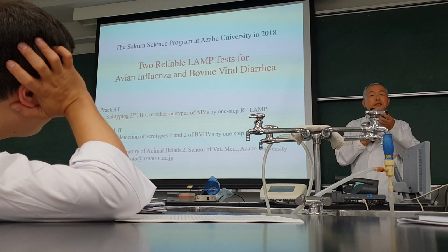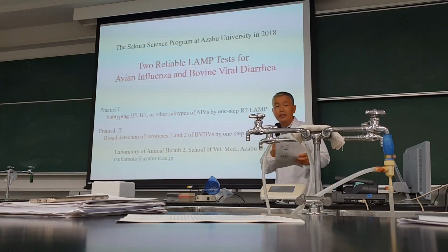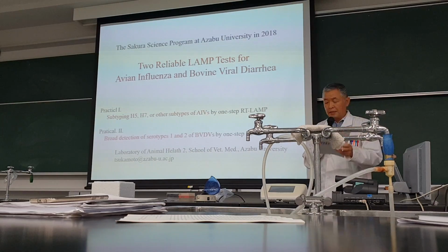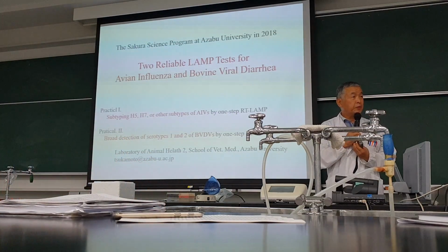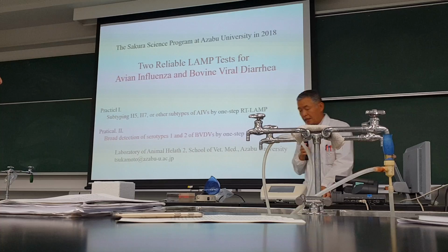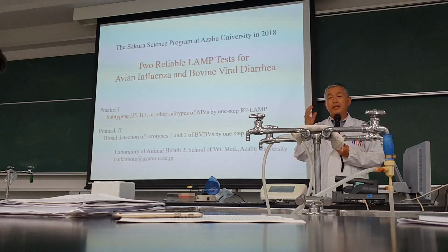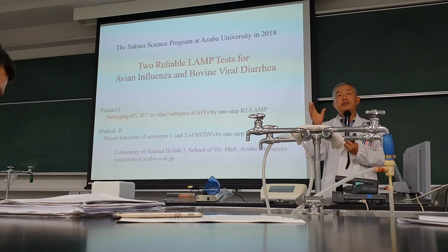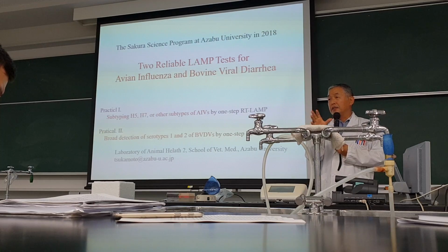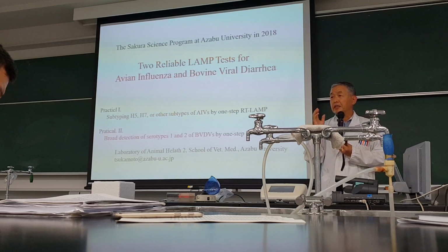Okay, so please look at the textbook. The first page is, do you know the LAMP system? Have you ever used the system before in other diseases? The LAMP system is very simple to do. Just add the genome itself into the reaction mixture and incubate, in our case, for 40 minutes. Just 40 minutes is sufficient to detect the genome.